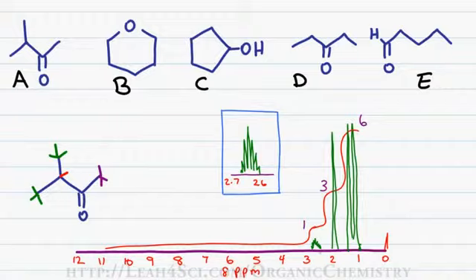Many times when you see a multiplet on the graph and are unable to tell exactly how many peaks, you will be given an expansion that tells you where it came out of the graph. So notice that we have 2.6 to 2.7, which is approximately between 2 and 3, closer to 3. But in the expansion, we can actually count the tips here. 1, 2, 3, 4, 5, 6, 7. And yes, this is the septet that we predicted. And last but not least, our methyl group that has no hydrogen neighbors is represented by that middle singlet at approximately 2.